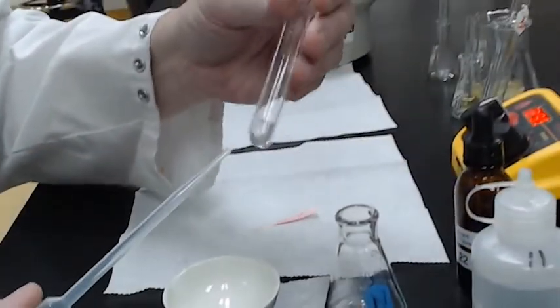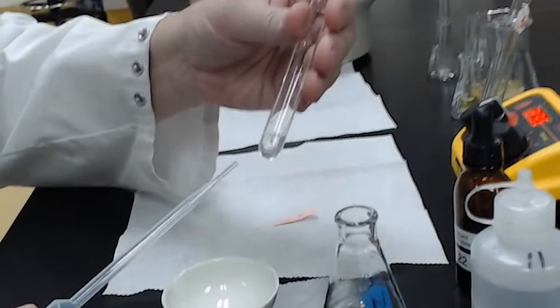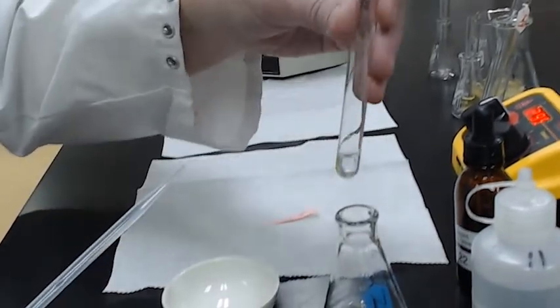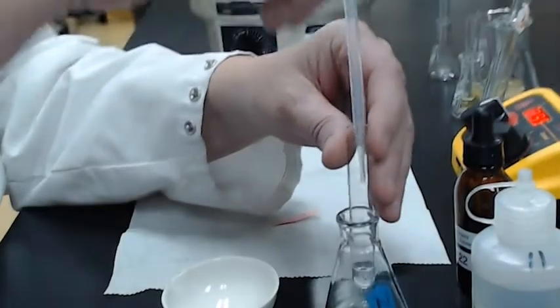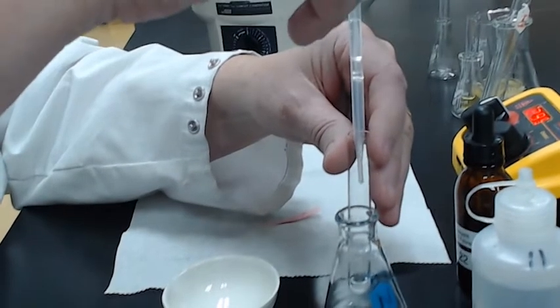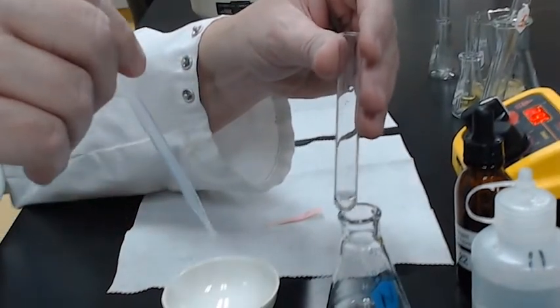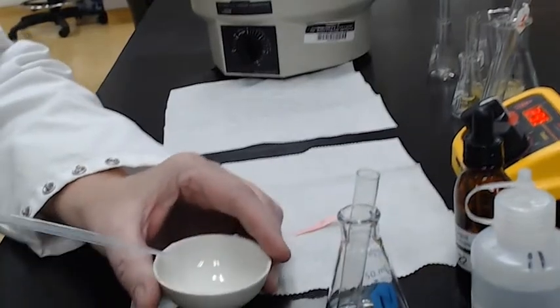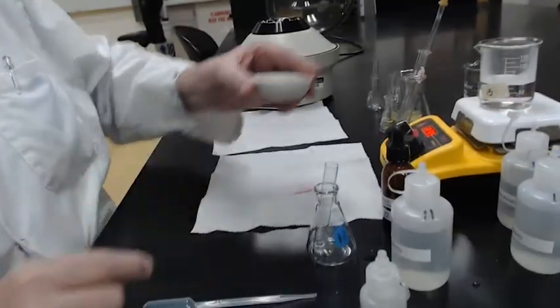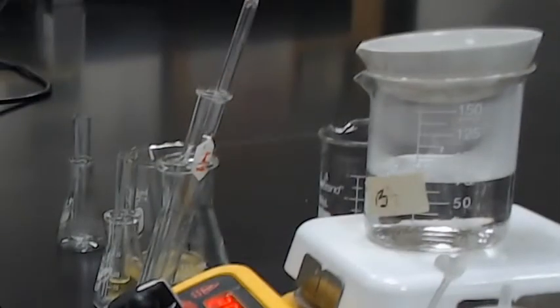Okay. Again, we have the supernatant that we have removed calcium and barium from. It has a possibility of magnesium, sodium, and potassium left. The first step is to divide it approximately in half. Whoops, I took it all. Okay, and put half of it into an evaporating dish, which we are going to do. So I just put a little drop here, and we're going to set the evaporating dish on this boiling water bath, and that'll help the water evaporate better. Once that's condensed down, we'll try a flame test to check for sodium and potassium.